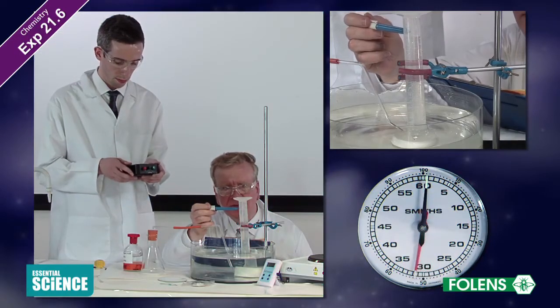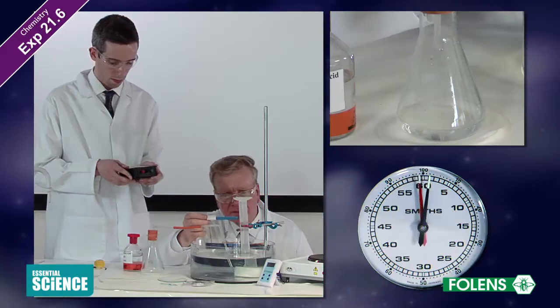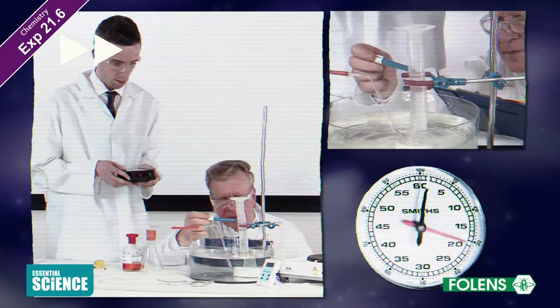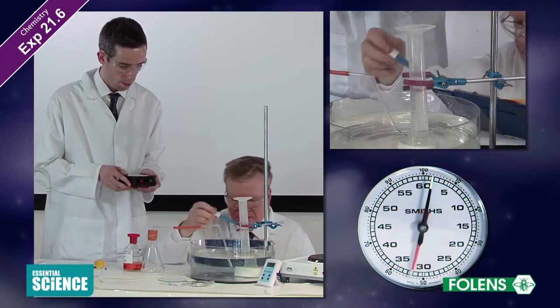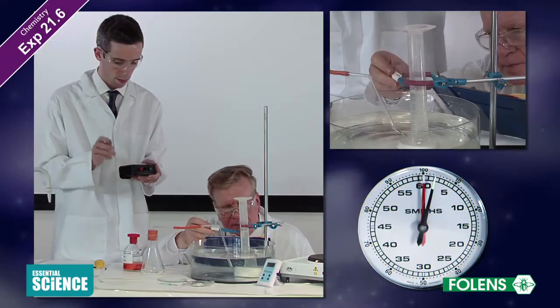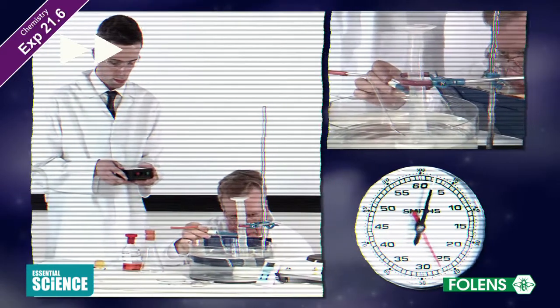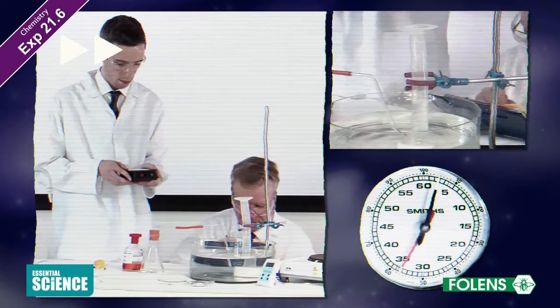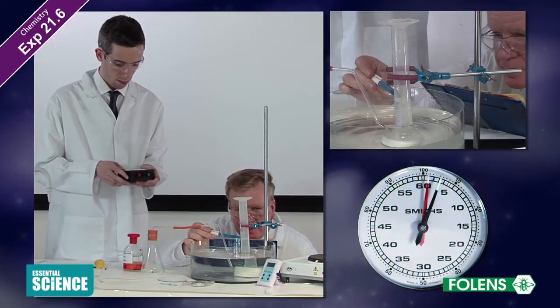30 seconds. 60 seconds. 90 seconds. 120 seconds. 150 seconds. 180 seconds.